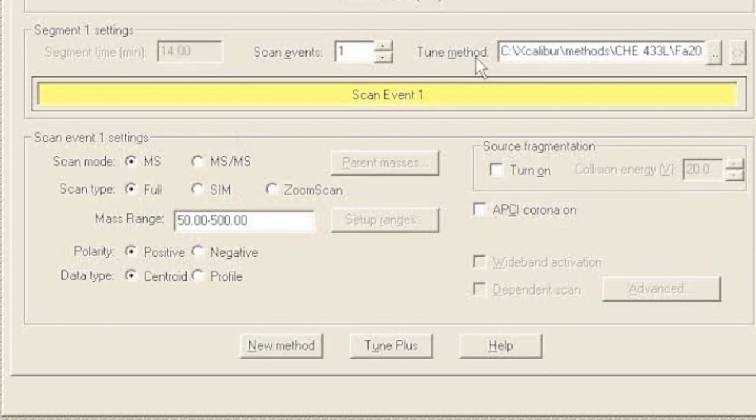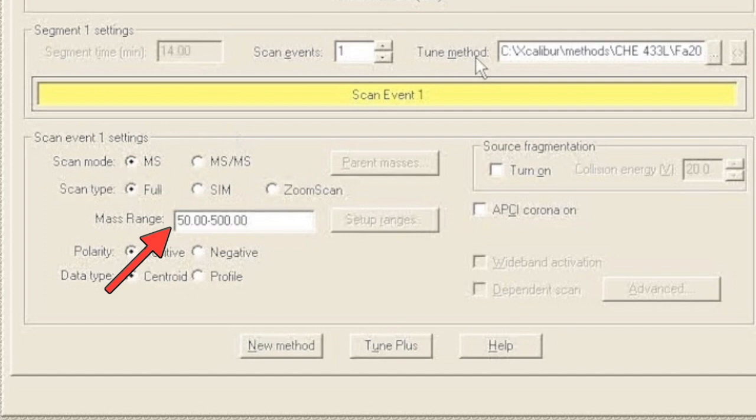Next thing we want to look at is our mass range. 50 to 500 is going to be pretty good for most forensic purposes for drugs and explosives, because most organics have masses between 50 and 500. When you get into biological stuff or biochemistry, you need to go bigger than 500. When you get into elemental stuff, you need to go smaller than 50, but most organics are going to tend to be between 50 and 500.